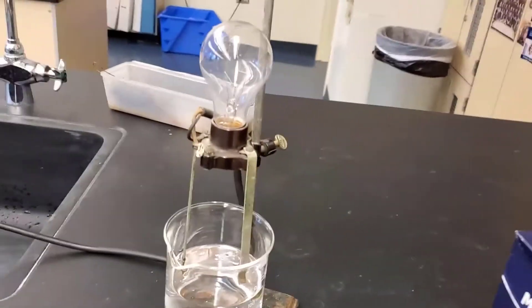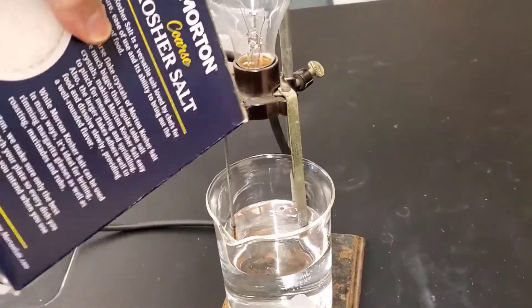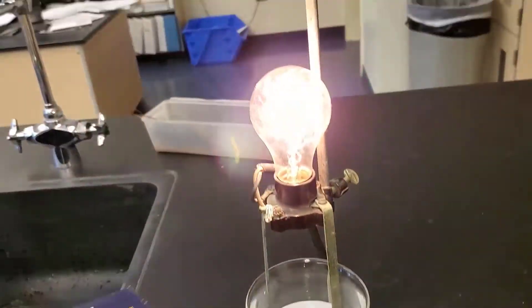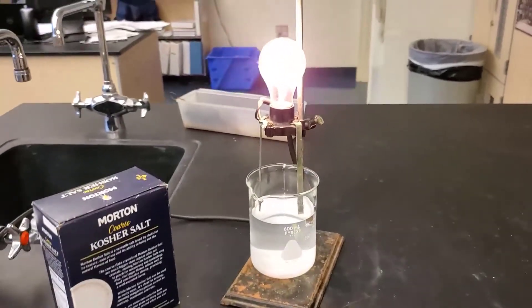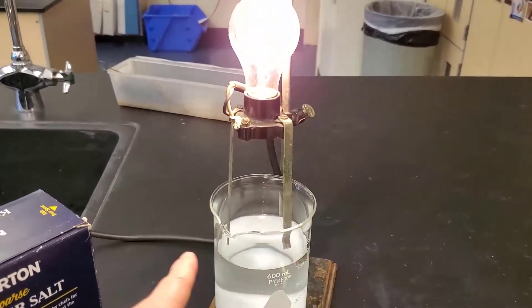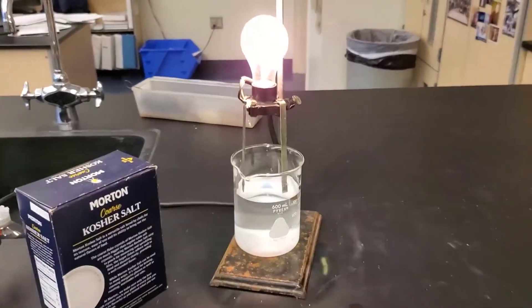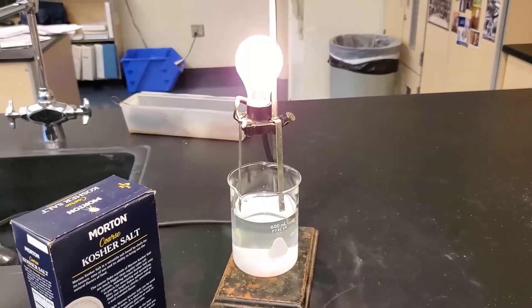Let's take an ionic compound like salt and start adding it and see what happens. The light bulb lit because this ionic compound has dissolved into ions, and it's allowing a charge to go from one electrode to another to complete the circuit. So there's a property of ionic compounds — they conduct when dissolved in water.